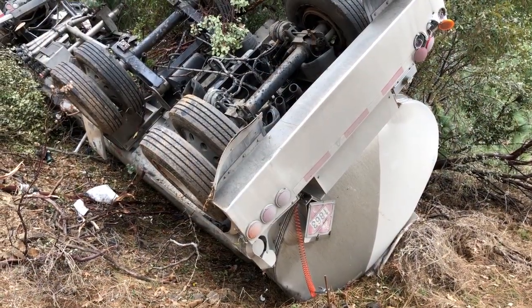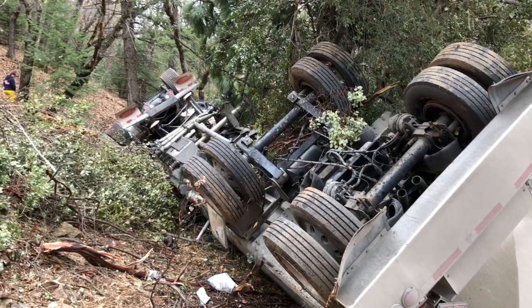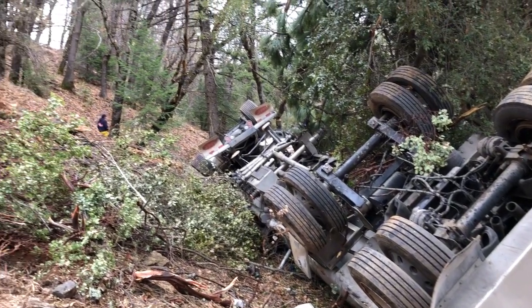Hundreds of oil spills occur in the state annually from incidents like this tanker truck rollover, but not all spills have a known source. That's where the lab fits in. Our main purpose here is to support our wardens in their investigations and do some forensic testing for them.